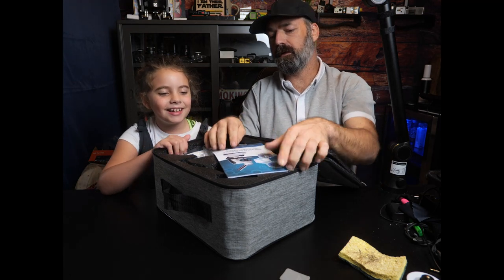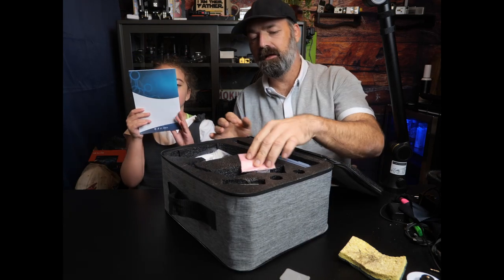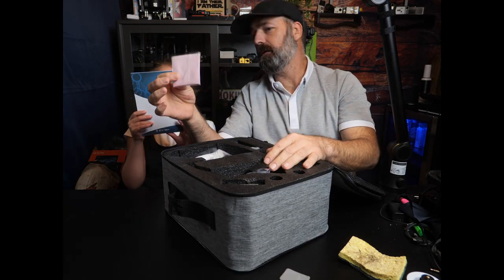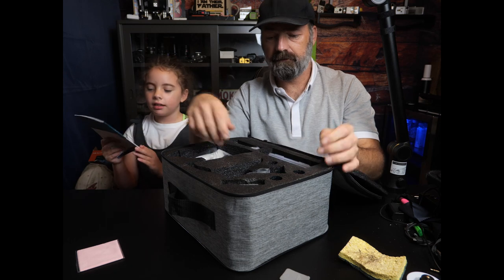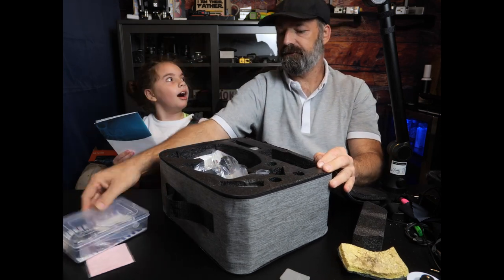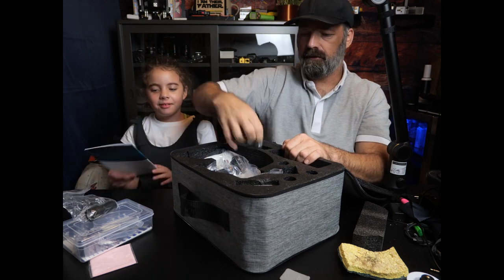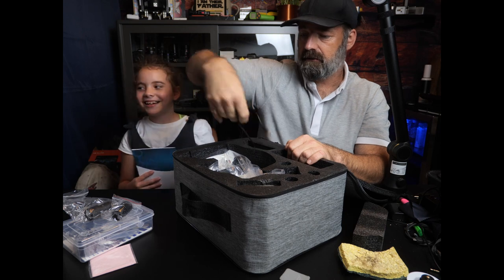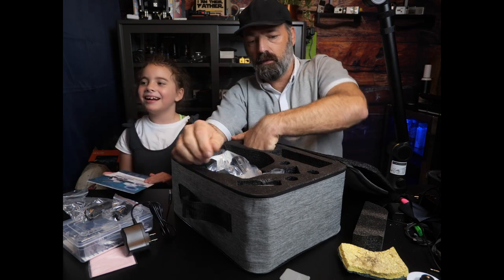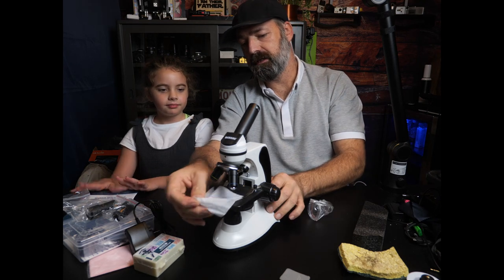Oh, you get a book. Are these blood cells? Maybe. You get a cleaning cloth. And you're going to get a box of stuff and some other stuff. We're going to go through all this and let you know what's included. A cord. And here is the microscope itself.